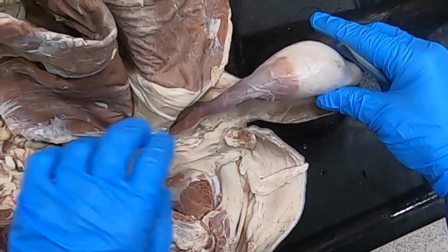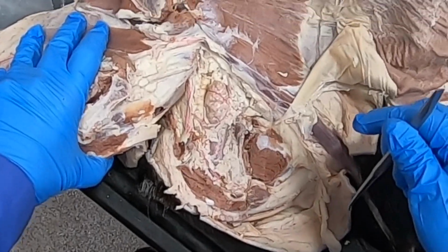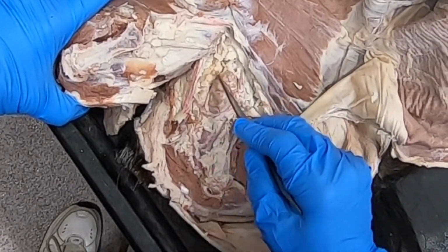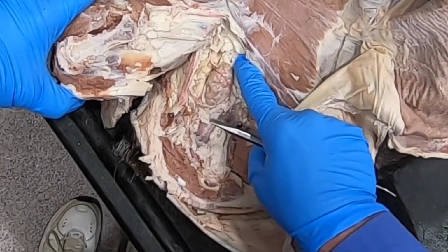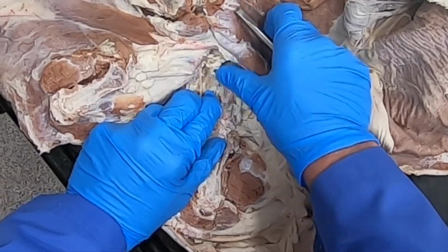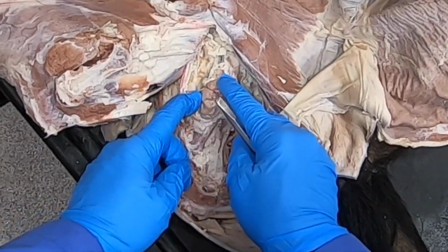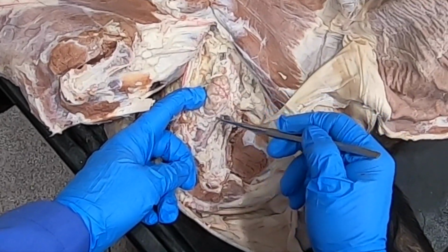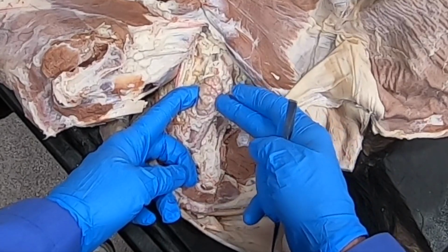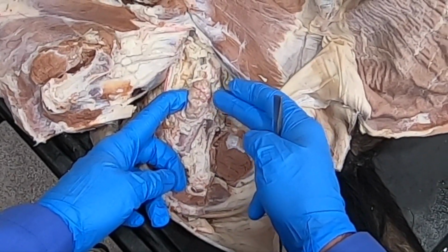Cool beans. And so also what we see here, the rectum is up here. We've got this structure here, which may be confused as the prostate, but is actually the seminal vesicle or the vesicular gland.